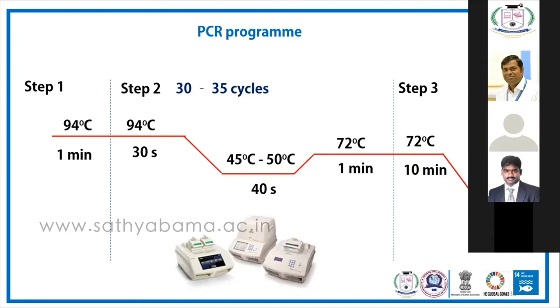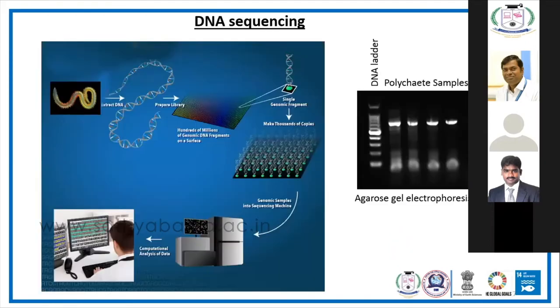If we get the animal, we start to extract the DNA, but this DNA work takes more than one week for identifying, isolating and amplifying the exact DNA size. Okay, then after a PCR, we just run the agarose gel electrophoresis.